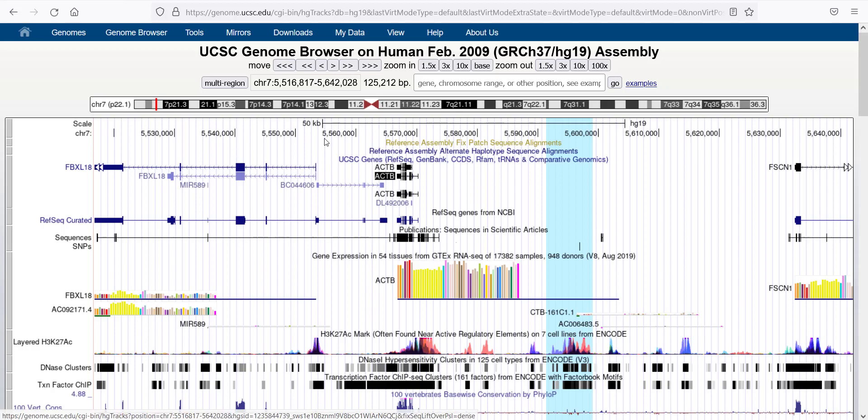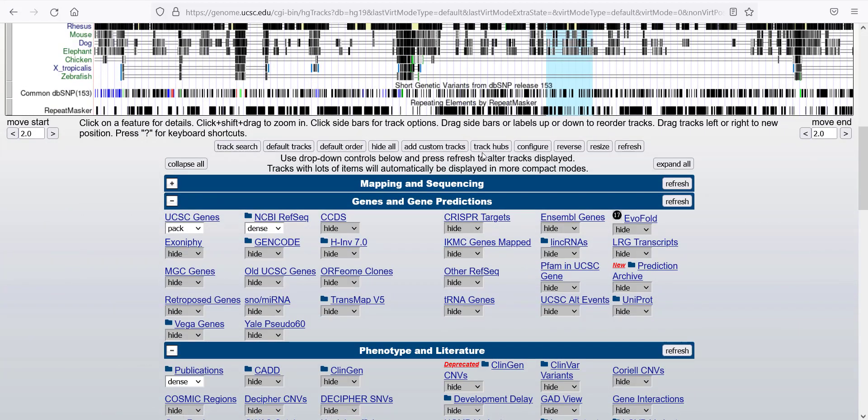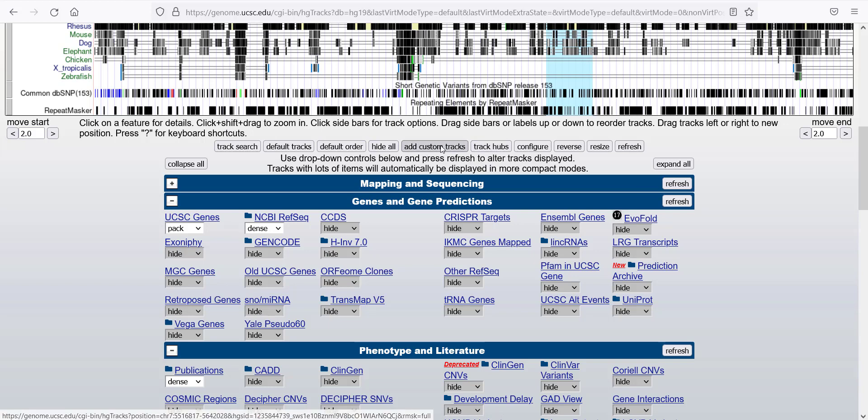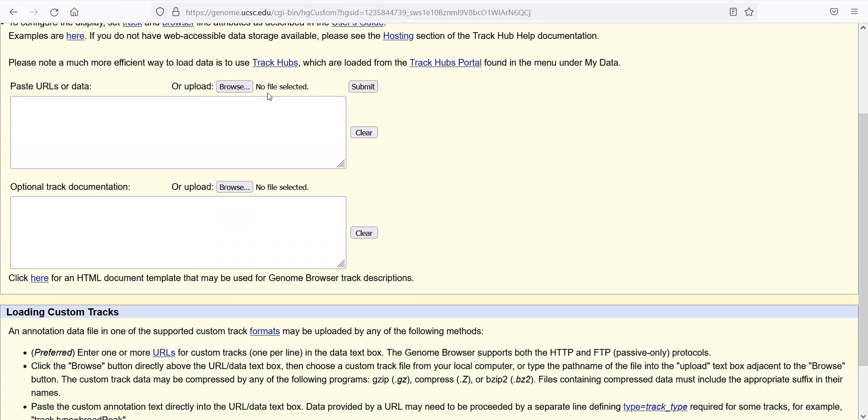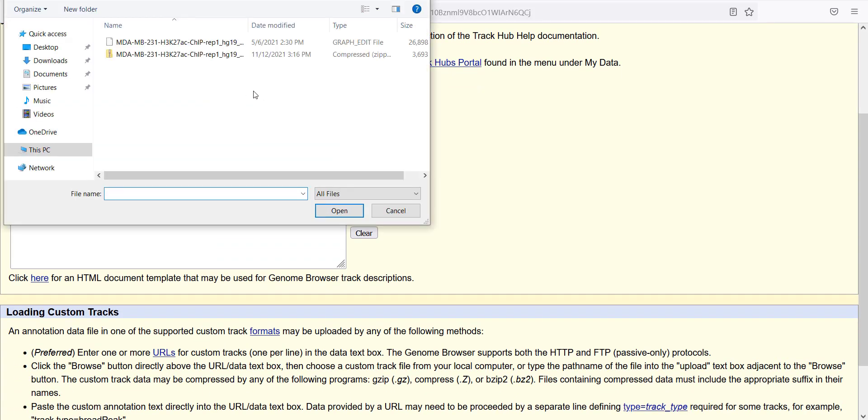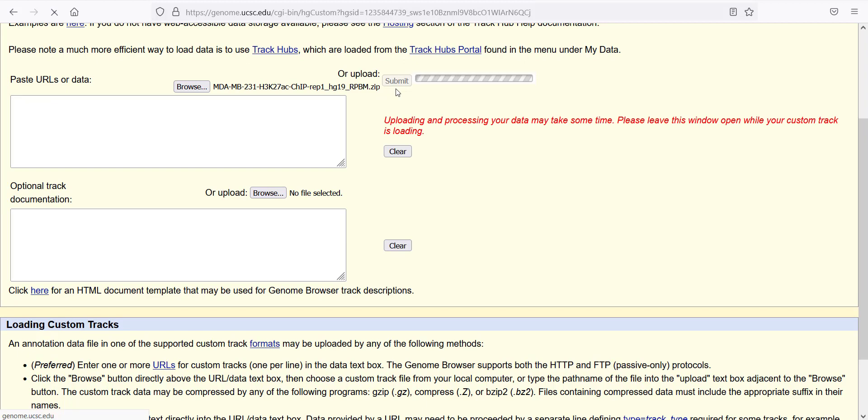To find the Add Custom Track button, it's below and you click on this. Then you can click on Browse to upload your specific file. This can be a zipped form in this case. And then I click Submit here.